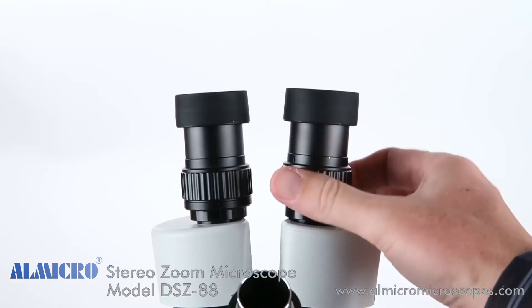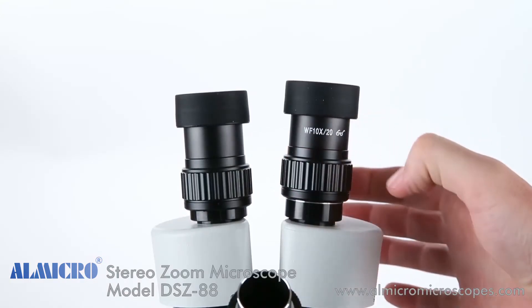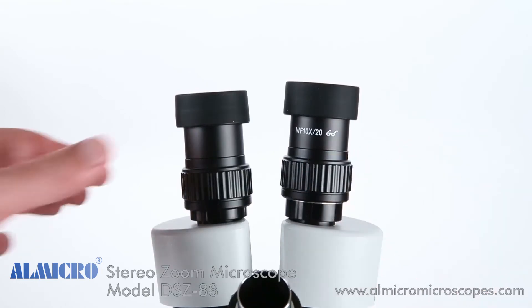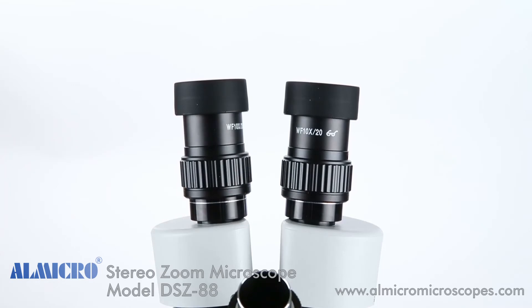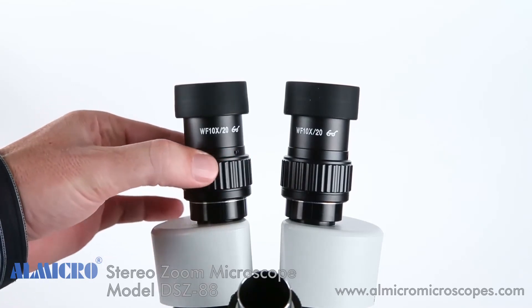On the SM2 series head, each ocular tube has a diopter for independent focus adjustment. Each ocular tube has a silver ring, and the diopter must be set to just above that ring to maintain focus throughout the zoom range.